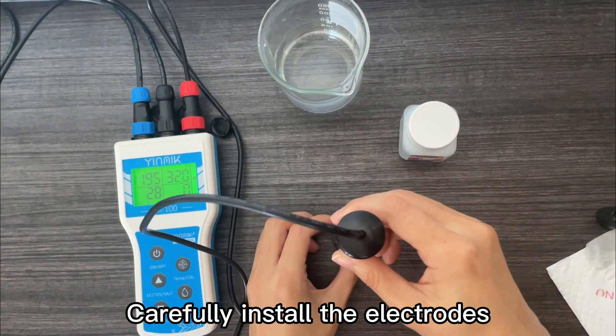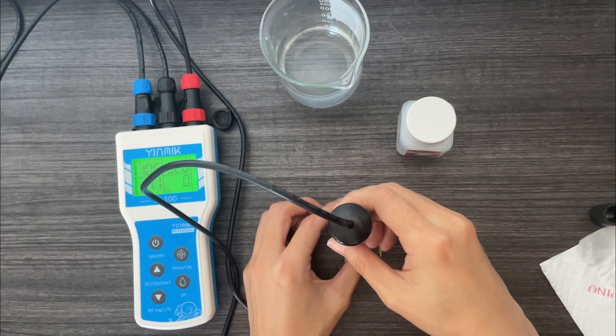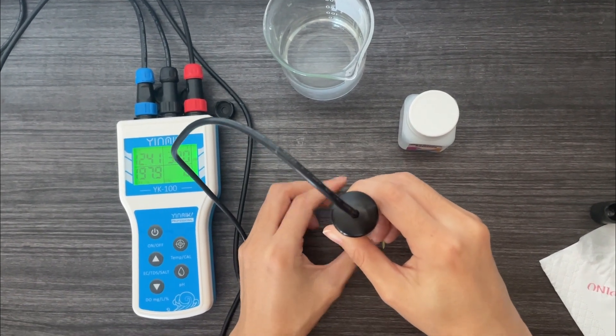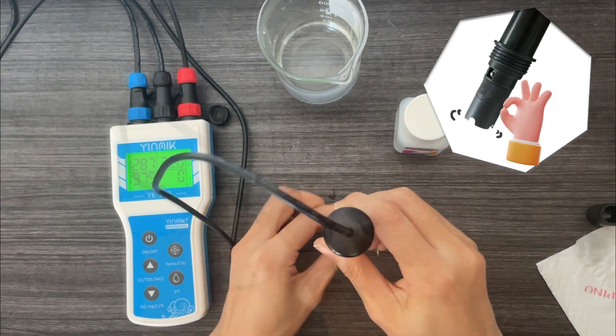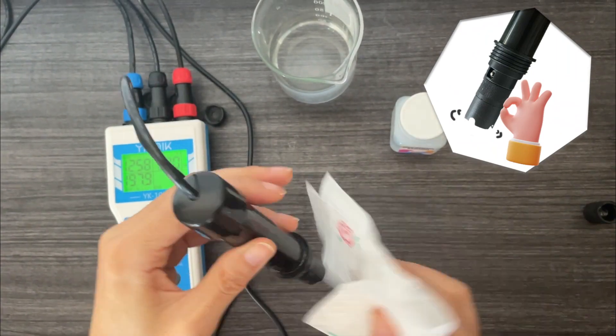Carefully install the electrodes. If excess liquid spills, don't worry, just wipe it up. If there are air bubbles in the membrane, flick them away with your fingers.